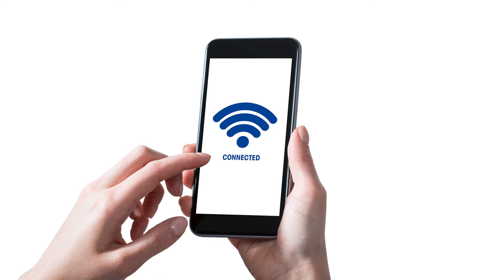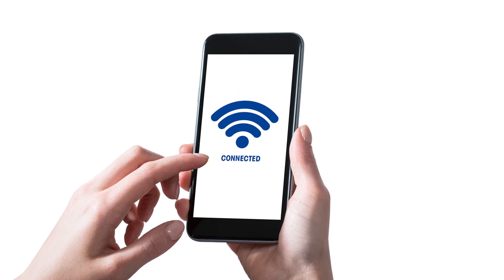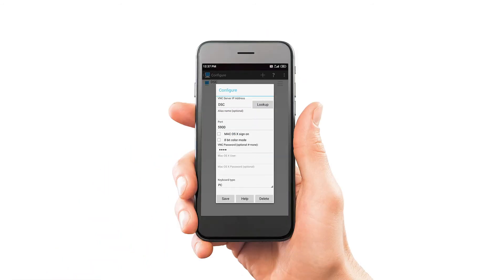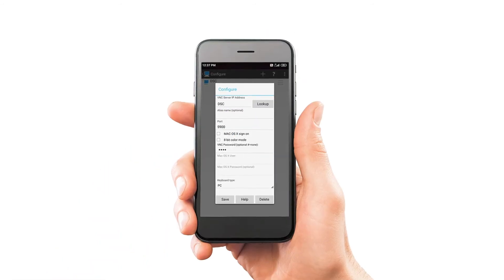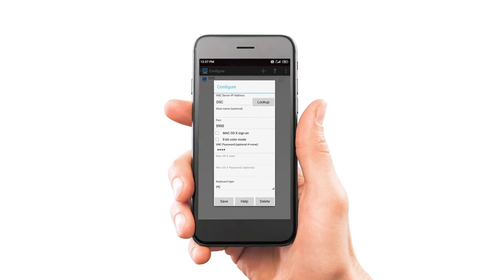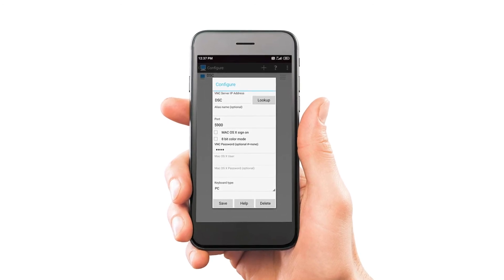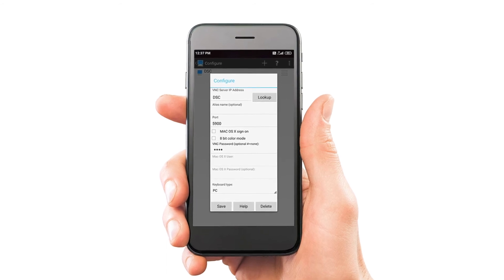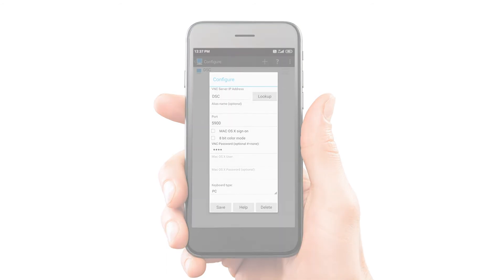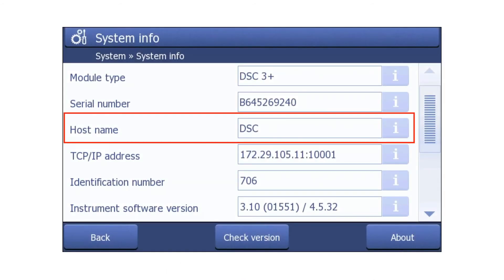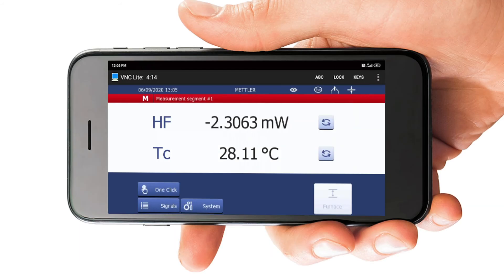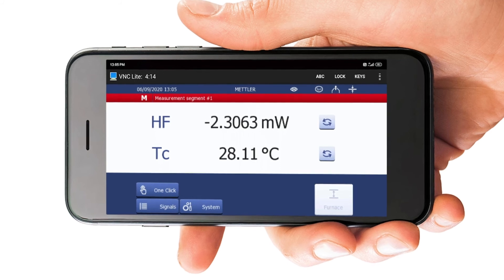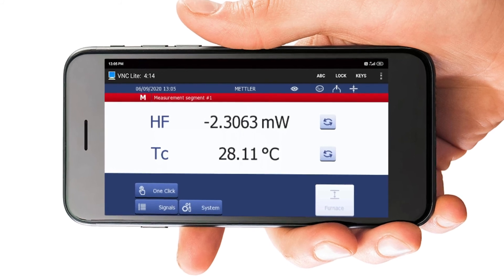Connect the smartphone to the company's wireless local area network. Now, open the VNC app on your smartphone and enter the instrument's exact host name and the previously defined VNC password. The host name can be found on the terminal screen of the TA module. Activate the connection — the terminal screen can now be accessed from your smartphone.